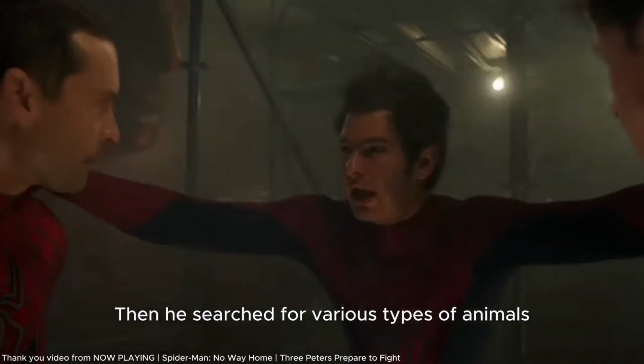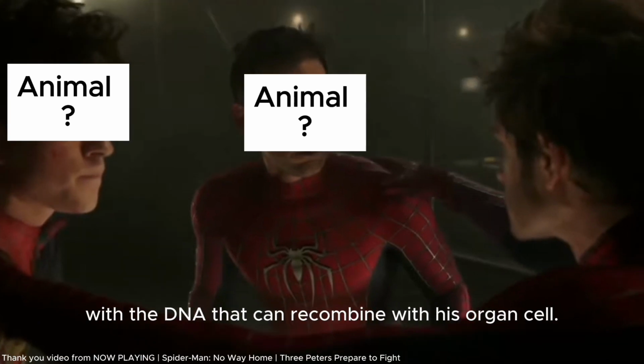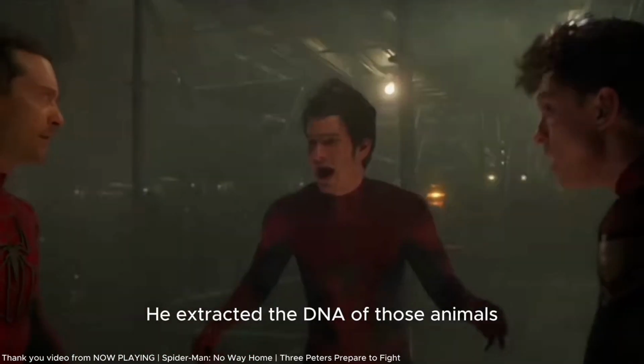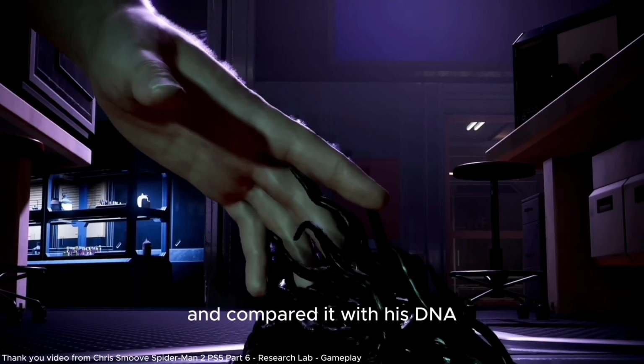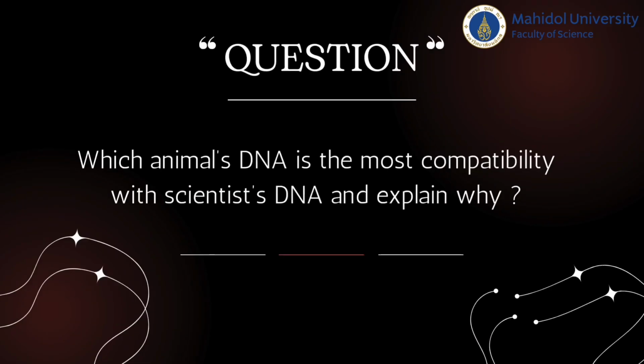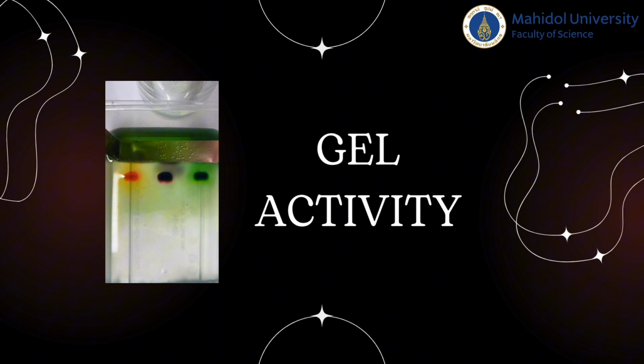Then he searched for various types of animals with DNA that can recombine with his organ cells. He extracted the DNA of those animals and compared it with his DNA to find a match in order to get his arm back. And from the situation, the question is, which animal's DNA has the most compatibility with the scientist's DNA, and explain why. So, to find the most compatible DNA with the scientist's DNA, we are going to use the gel electrophoresis activity to find it.